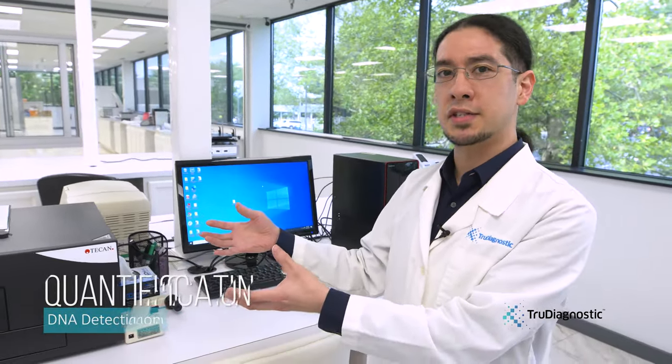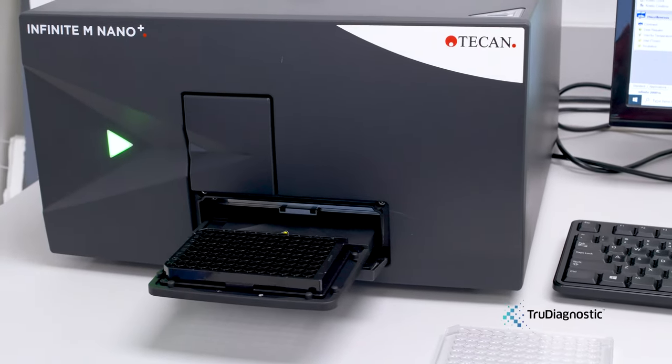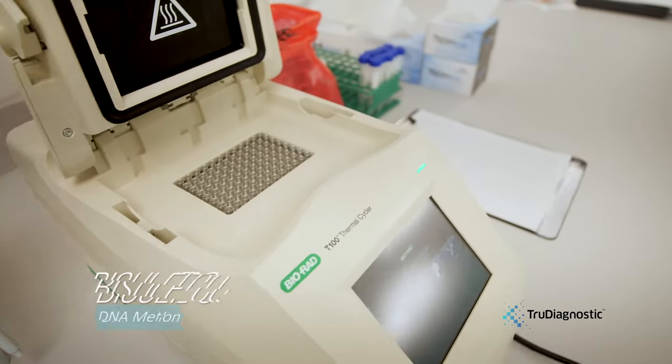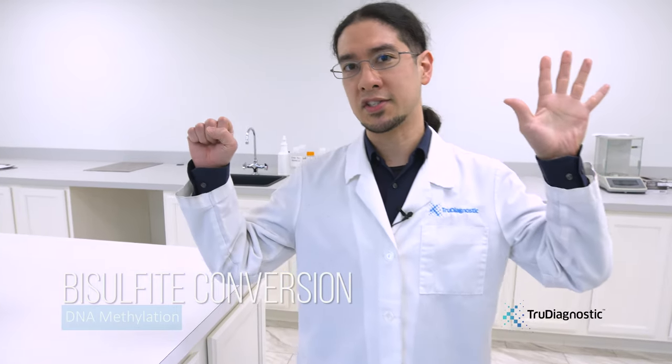This machine will read the fluorescence and we'll be able to compare it to a known standard, which will then give us an exact concentration of the sample we are working with. The next step is bisulfite conversion, which is the gold standard by which DNA methylation is analyzed. This protocol begins by looking at the methylated cytosines and non-methylated cytosines.